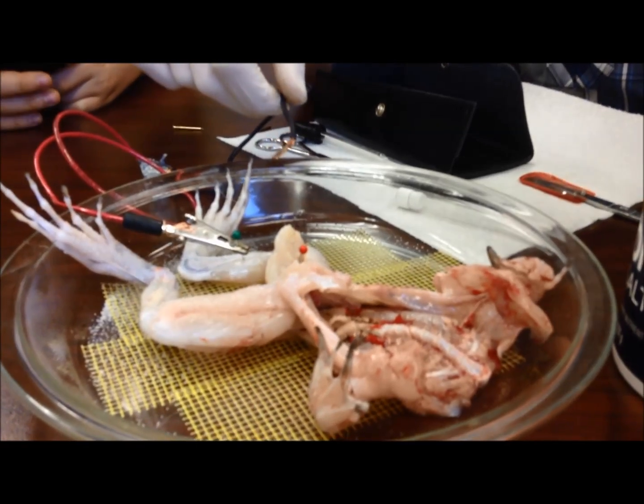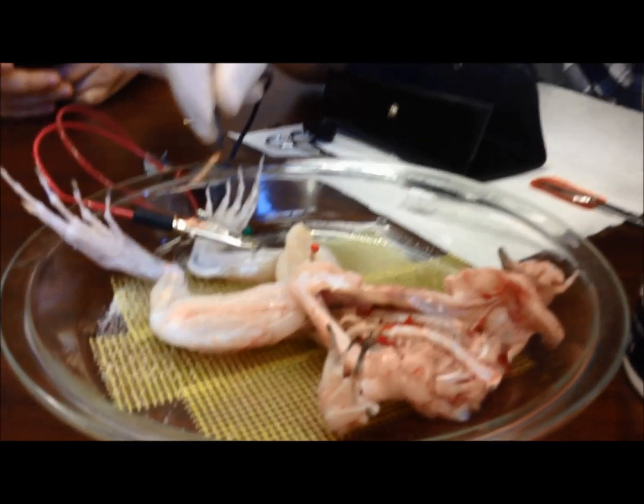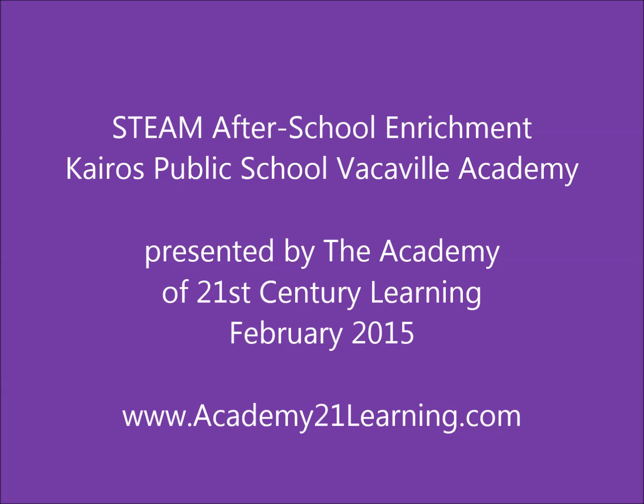Until it dies, of course — until there's no longer any energy to help it contract. So that's why when we pour salt on it, we stimulate the muscle without the nerve.